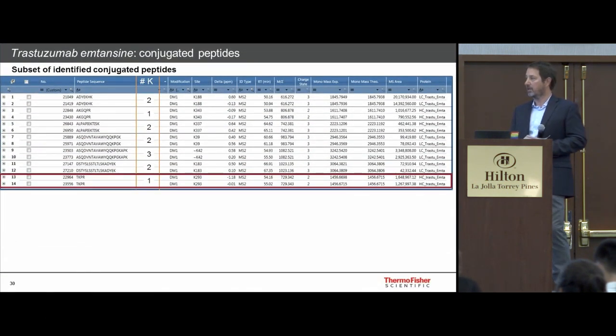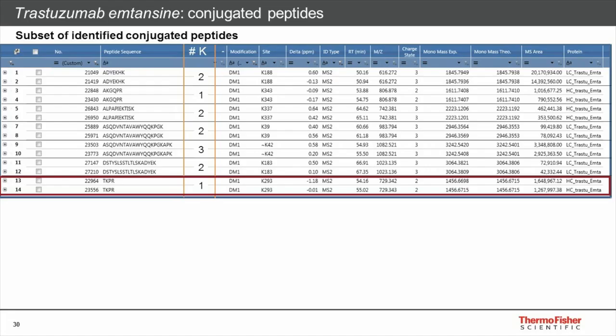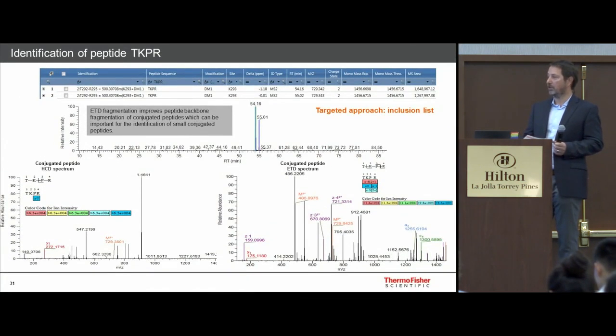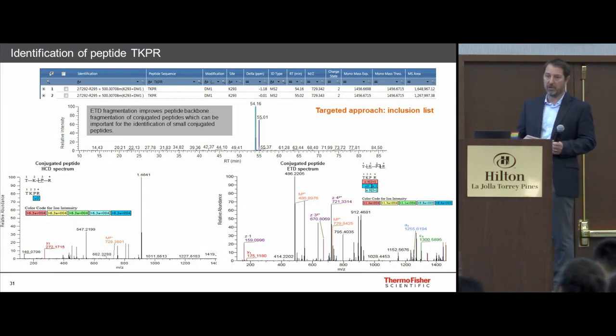So now if we look at this little peptide, there's just like one lysine. So we don't need ETD to know which one is conjugated. But you get this doublet around like 55 minutes. And again, I use a targeted approach to get the highest quality MSMS I could get. And what you have, it's a lot of neutral loss. So this is your 547, that you know that it's a neutral loss from the linker drug. And the 911 is actually the complementary ions. These two are the most intense one, and actually you get just 1 fragment ions.